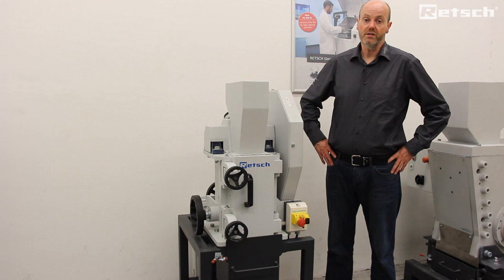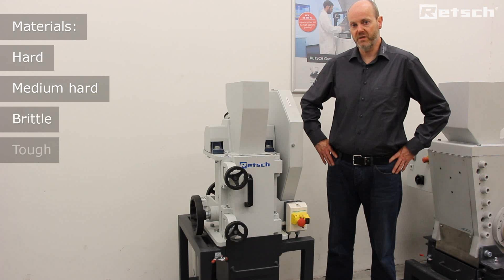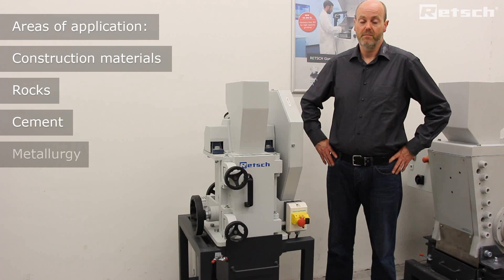Jaw crushers such as the BB250 XL model are used for the preparation of hard, medium hard, brittle and tough materials. Common examples of application areas would include the preparation of construction materials, rocks, cement, metallurgy and many more.